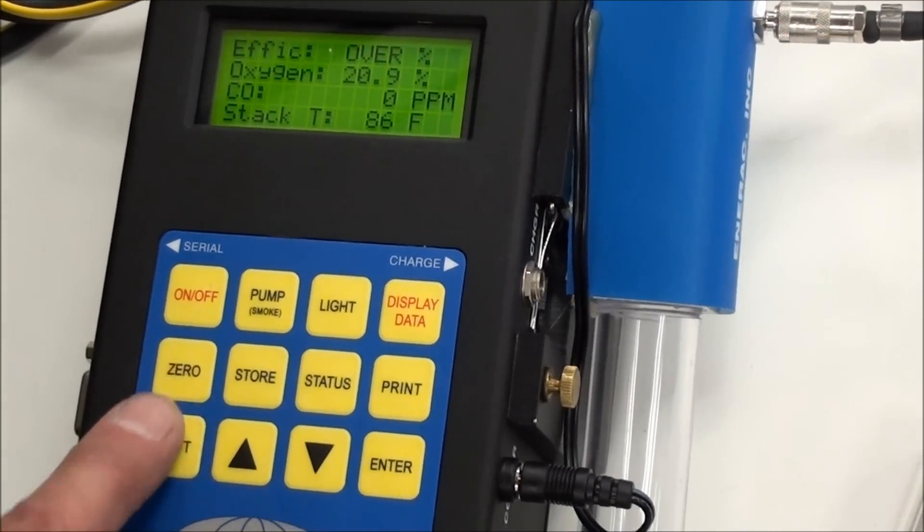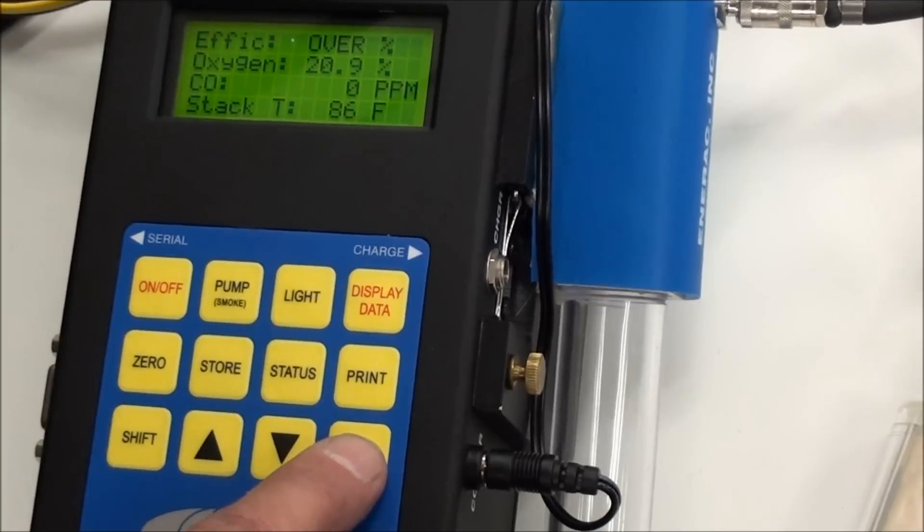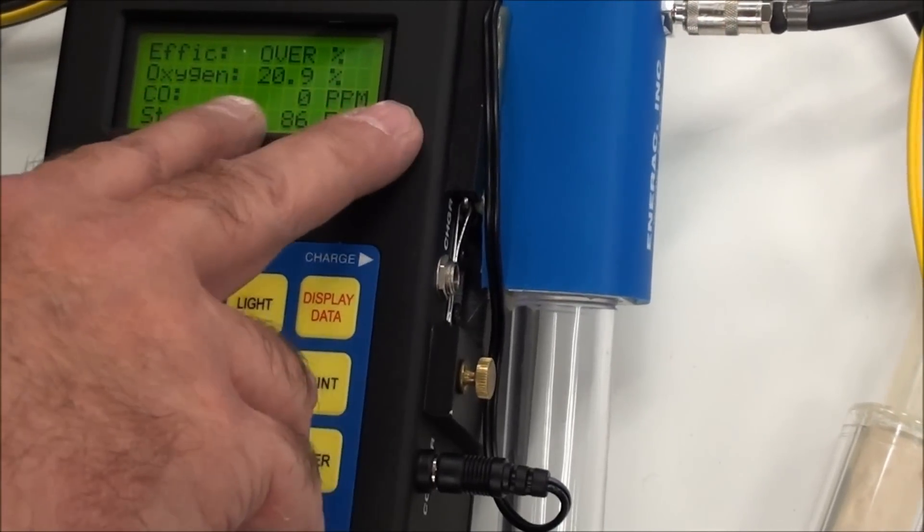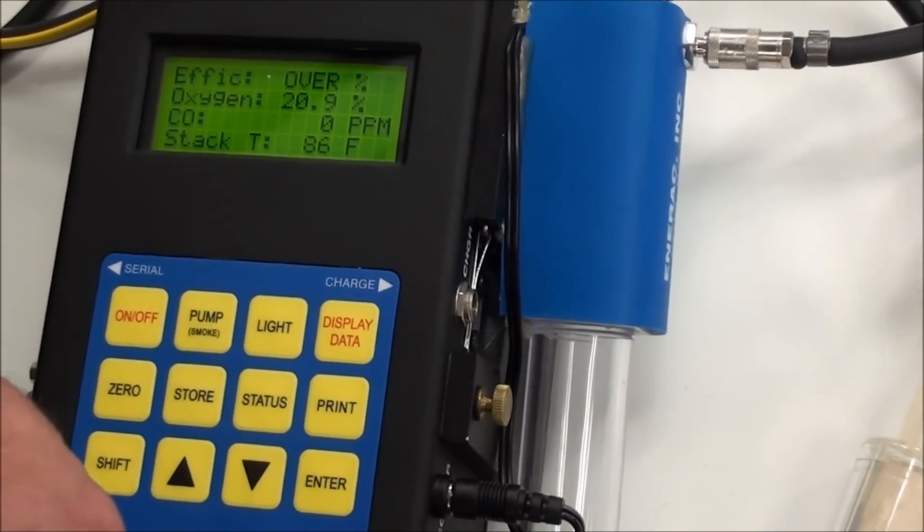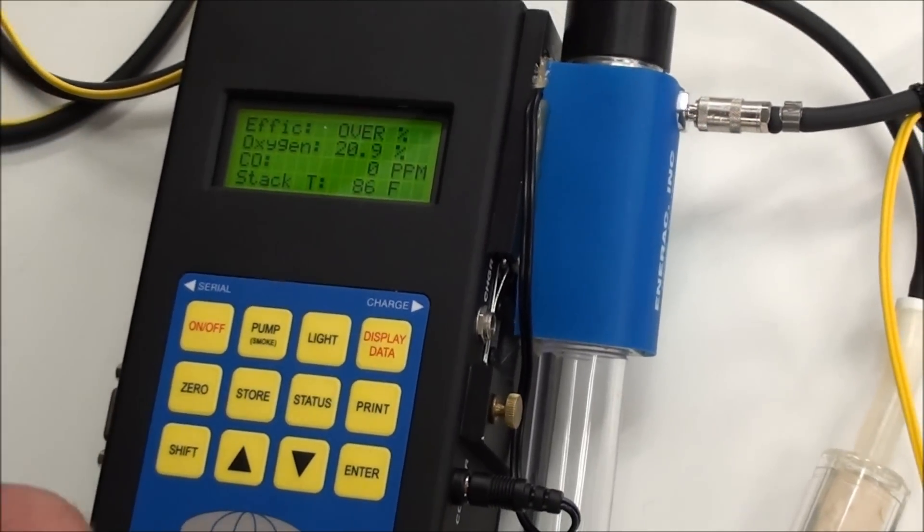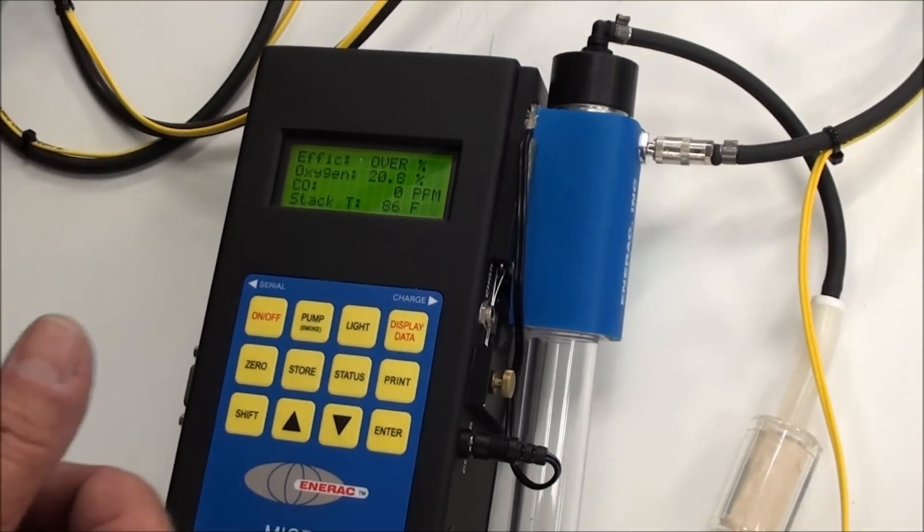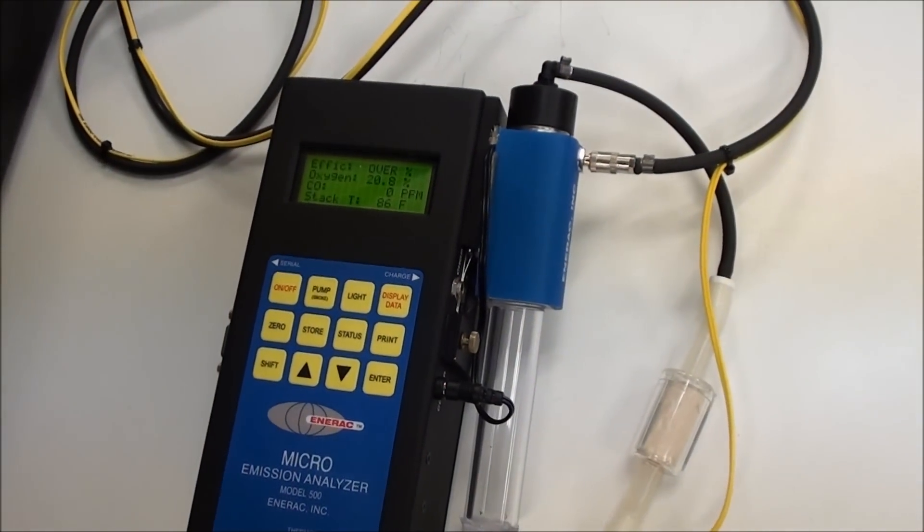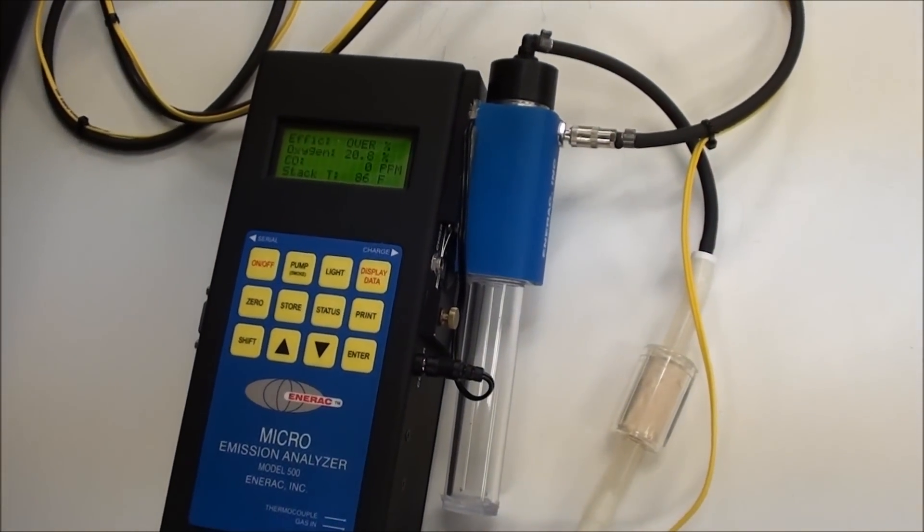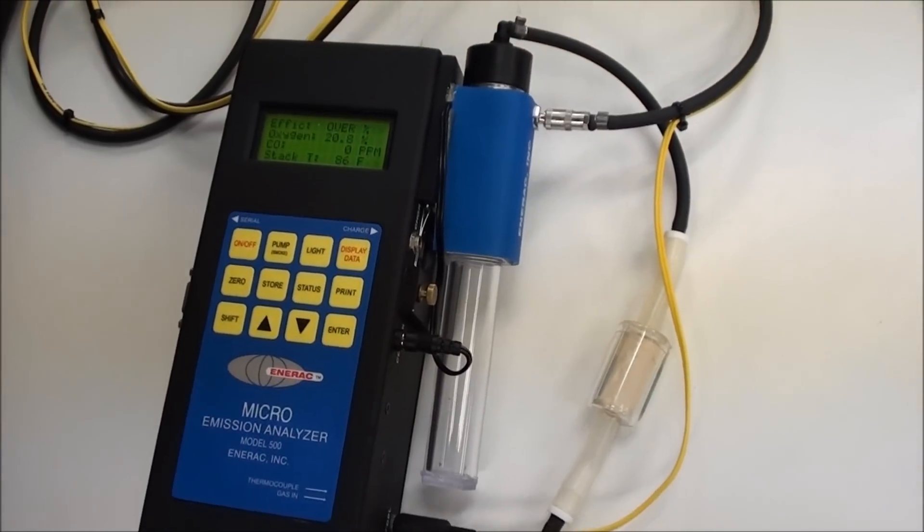You run the auto zero by pressing the zero and then enter, and you will see a countdown. It will count down from either 120 seconds or 180 seconds down to zero. At the end, it will zero all the sensors. Oxygen will read 20.8, 20.9. All the other sensors should read zero.